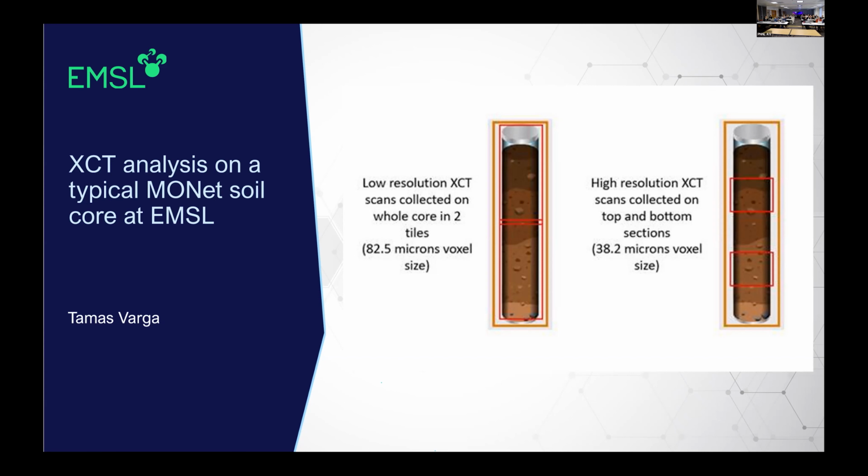Again, there is a resolution issue there, so you can't really capture fine roots at this resolution, but if they are well developed, you can definitely capture them and even maybe model them, because they are also kind of channels for transport, but with a different hydraulic property than the pores.